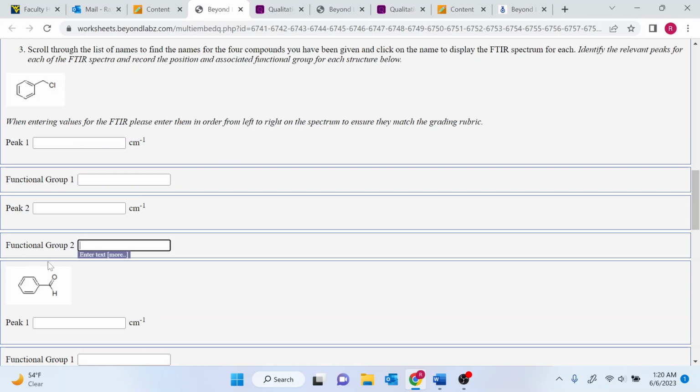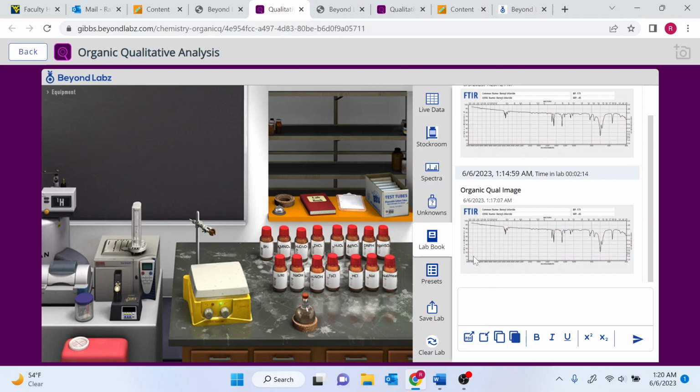The one that doesn't have a space to write down is the carbon sp3 CH stretch. Now this is not a functional group, but we always like to interpret the carbon sp3 CH stretch. In this case, if the signal doesn't have a place for you to put in the worksheet, then go ahead and put that in the workbook and type it down.